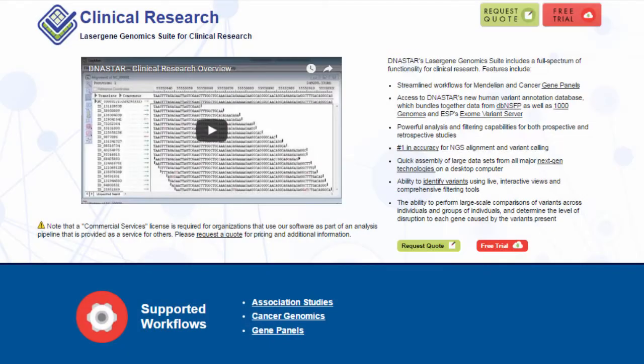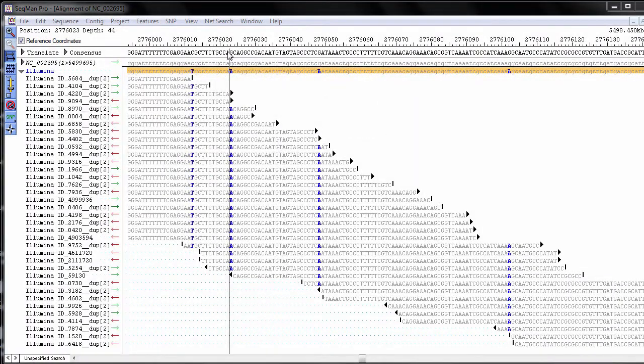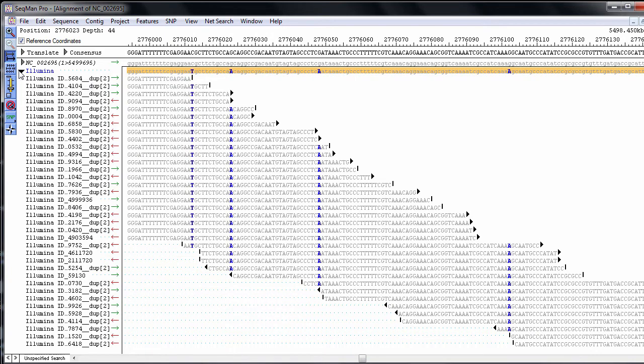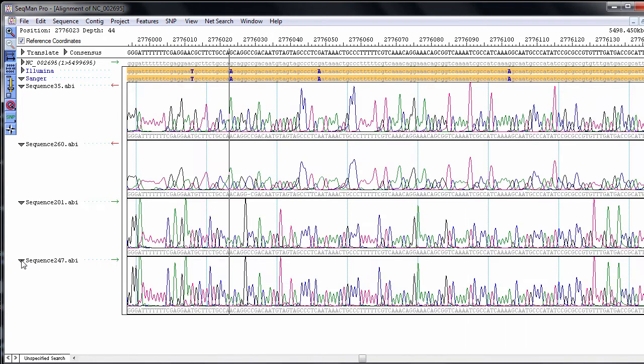LaserGene Genomics Suite can also be used for a variety of clinical research applications, supporting both Mendelian and cancer gene panel analysis, association studies, validation control, and Sanger validation workflows.